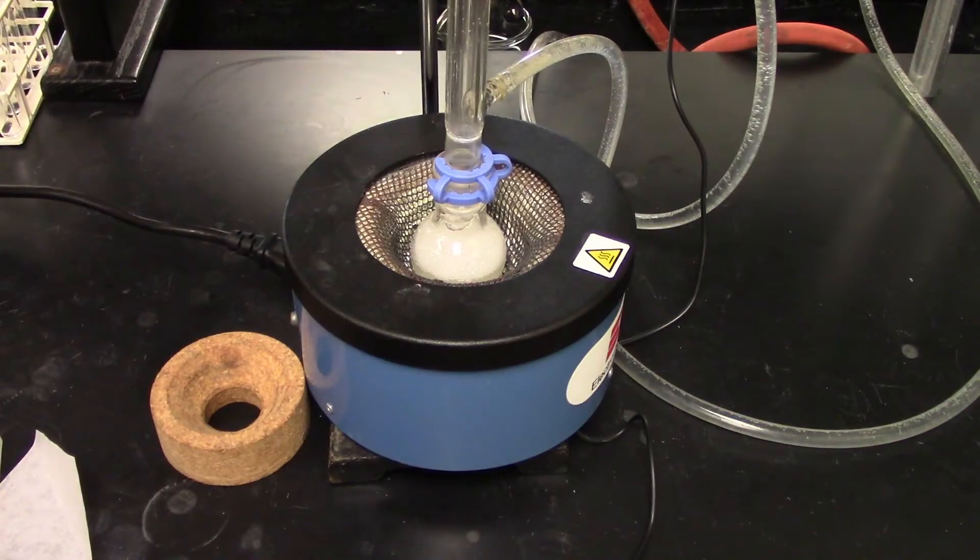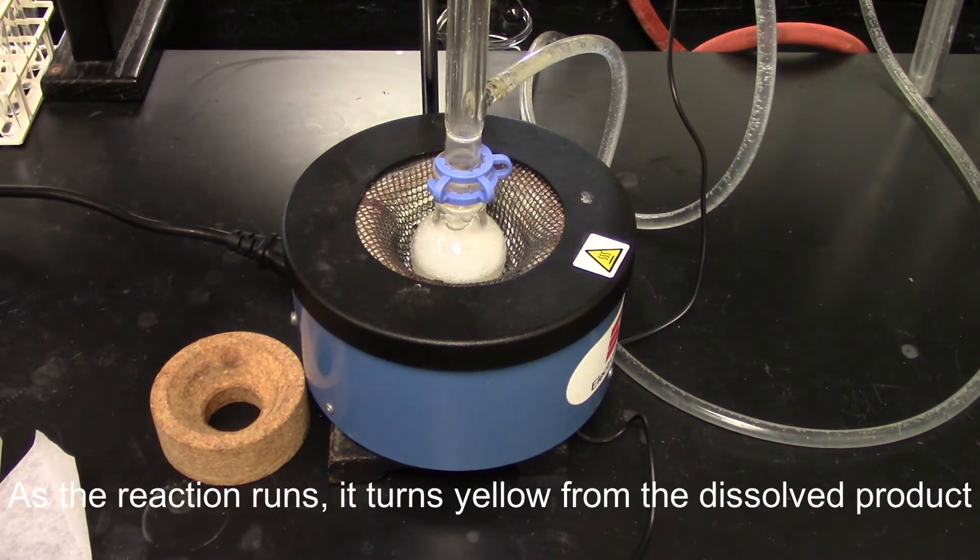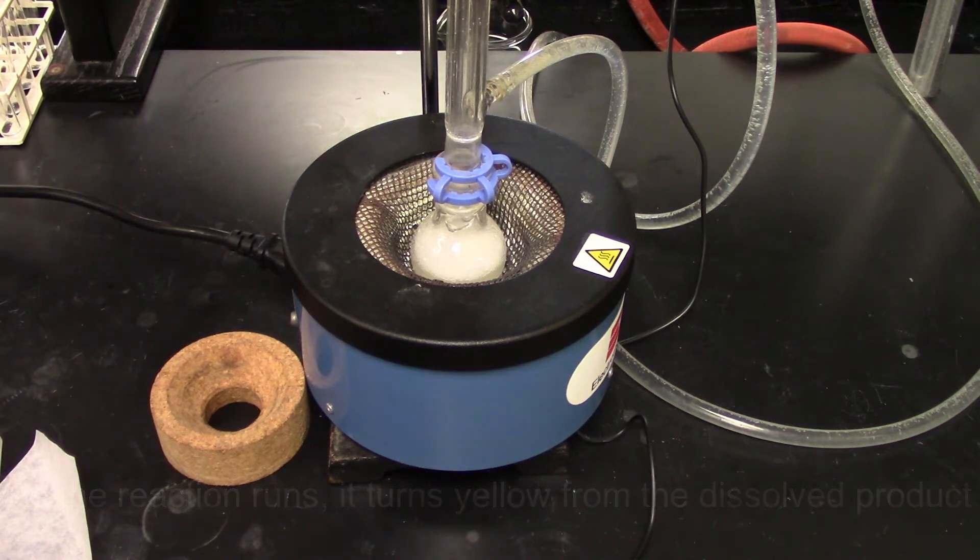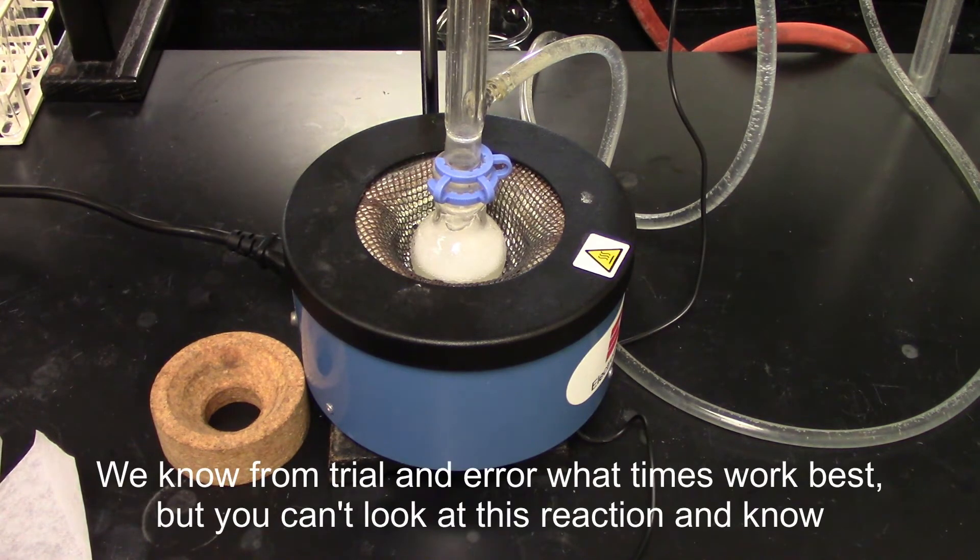Alright, so now we got the material to a fairly stable point. We turned the heat down and now it's just a matter of letting this reaction run to completion. We've optimized the time on this, so there isn't a good way to look and go 'oh it's done' at this point. But what we can do is run it for the requisite time that's in the lab manual, and when it's done we'll cool it down and start isolating the product.